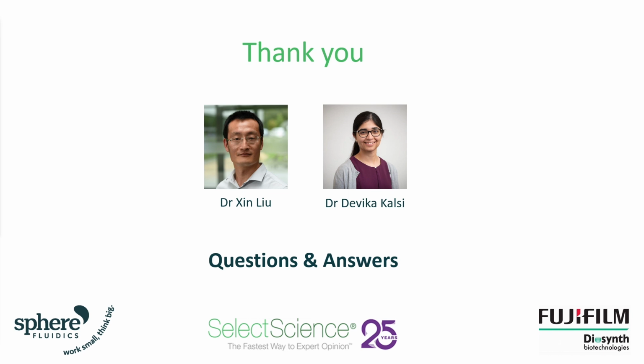I can comment from just the technology market perspective. I think there's a big task ahead of us, which is to be able to demonstrate a broader range of applications. So the bottom line is that being able to confine the single cells, 1 or 2 single cells in these miniaturized droplets, essentially opens the door for various new exciting application areas. As perfectly demonstrated by Devika here, you can confine the cells in there and build a high sensitivity assay to directly assay the cells on their secretion productivity.